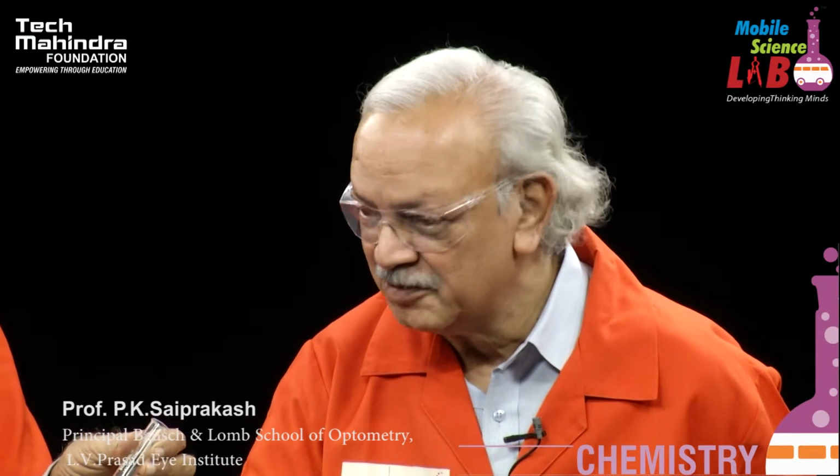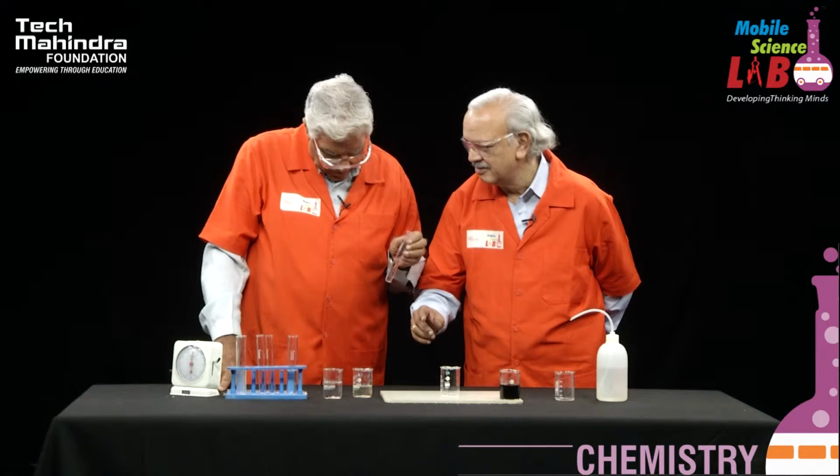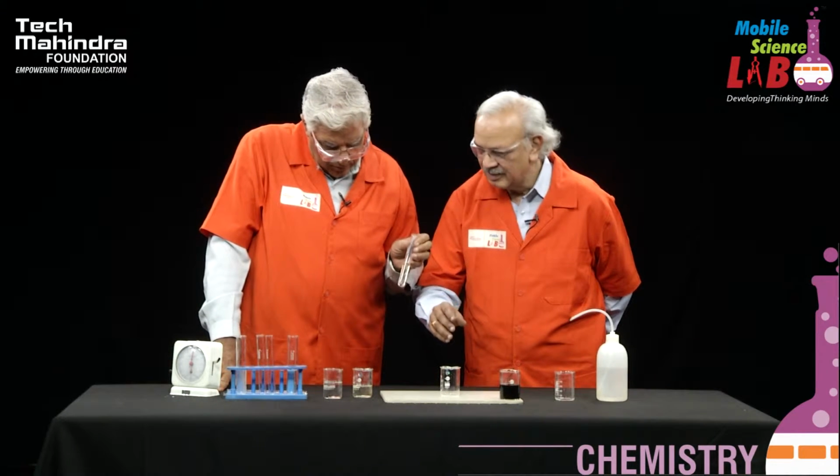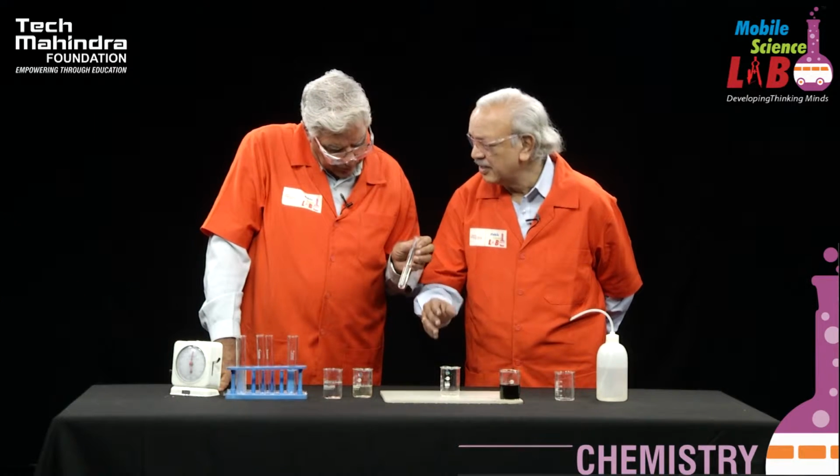So the first step was potassium persulfate and iodide react to give iodine in a slow step. But you have already added some hypo in this reaction mixture. That hypo reacts first with iodine, right? But since it is a small quantity and low concentration, remember you said M by 200 of hypo, the quantity of hypo is totally consumed. Once it is consumed, the next production of iodine will be a beautiful color.